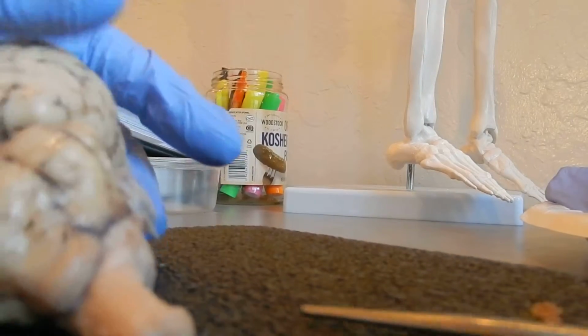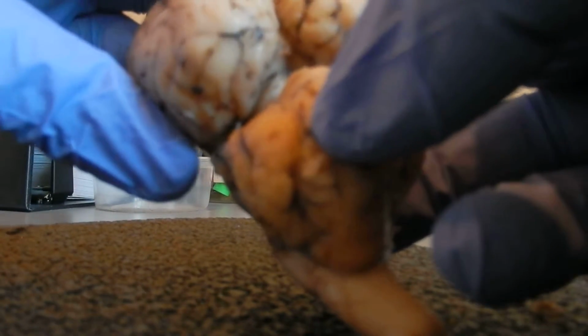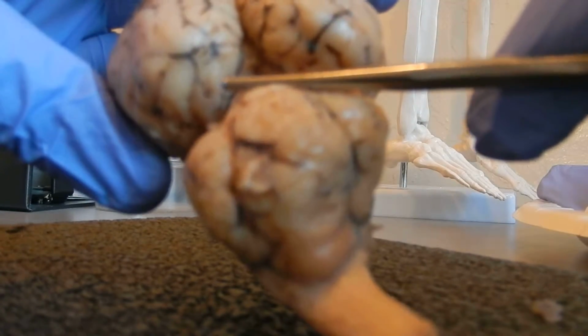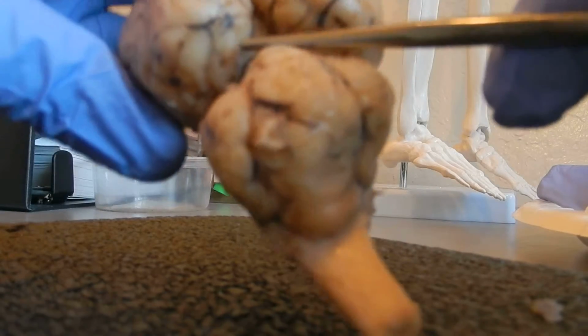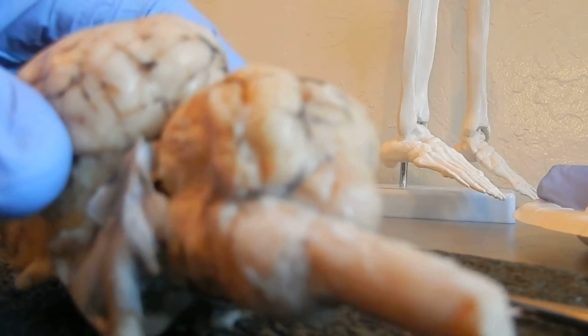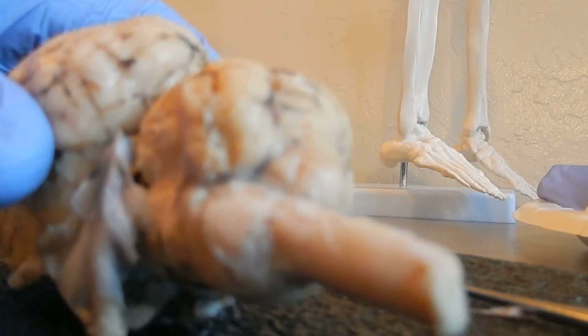We flip this over here. You can see in here, you can not only see the pineal gland in here, and then we'll move right along.